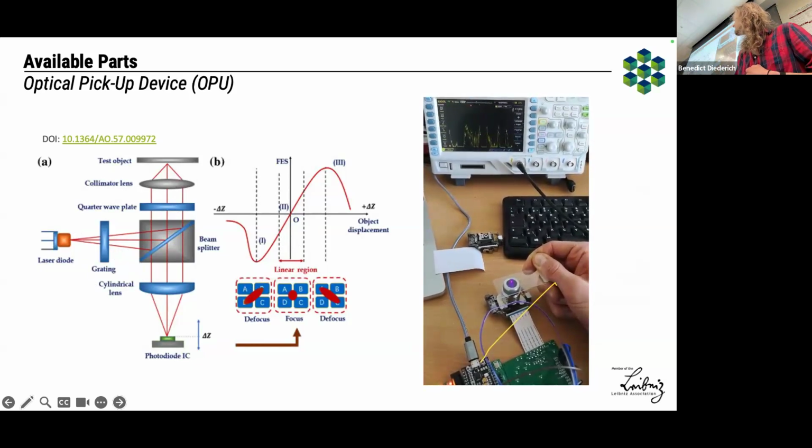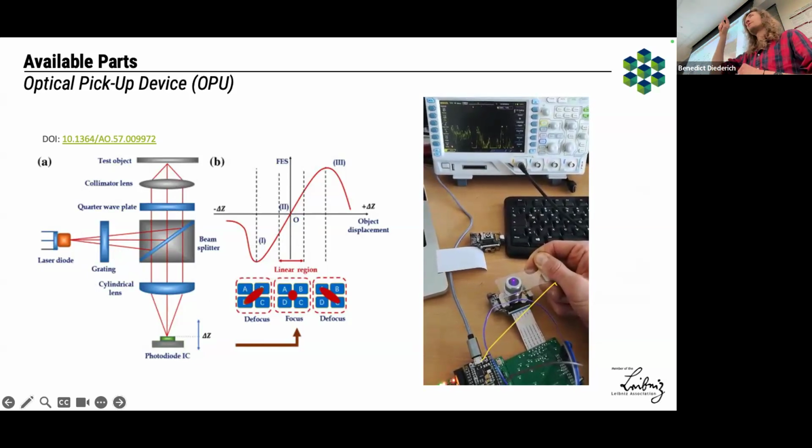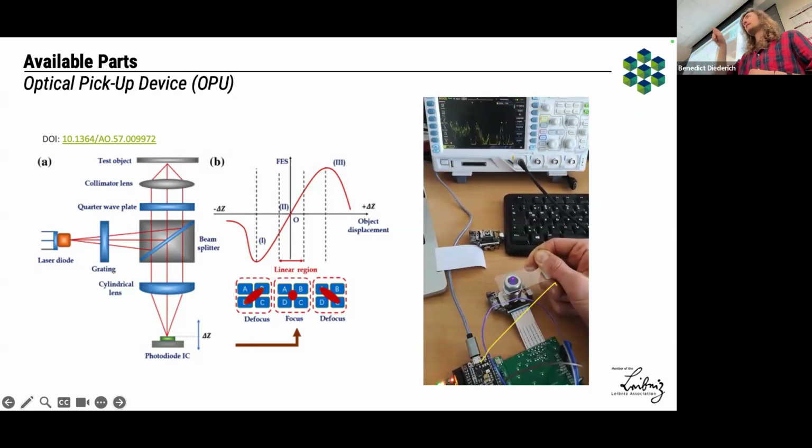To measure in the end, since you have one element that has some kind of astigmatism. Astigmatism is, I think some people have that in their vision. Basically, your lens is not perfectly circularly symmetrical, but rather like a rod-shaped lens, more or less. Then you induce this focus along the Z that is not symmetric, and then you perfectly know along the optical axis where your values are, which I think is pretty nice.